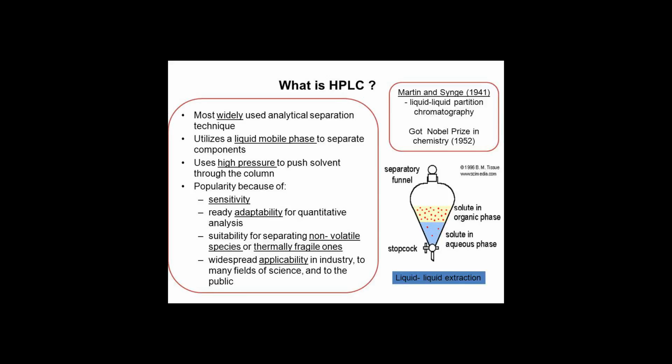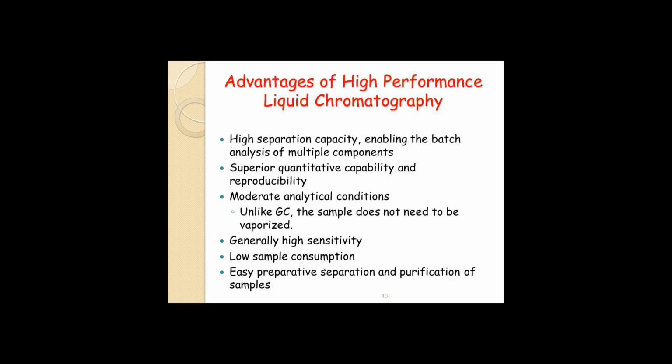Separation factor, alpha, is a relative comparison of how well two neighboring components of the mixture were separated, i.e., two neighboring bands on a chromatogram. This factor is defined in terms of a ratio of the retention factors of a pair of neighboring chromatogram peaks, and may also be corrected for by the void volume of the column. The greater the separation factor value is over 1.0, the better the separation, until about 2.0, beyond which an HPLC method is probably not needed for separation.